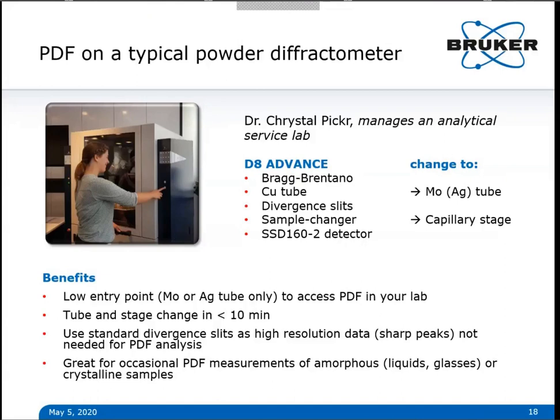The only strict requirement for PDF is a hard energy X-ray source, such as a molybdenum or silver tube, and a capillary stage is also recommended. Apart from that, all other components are already there.